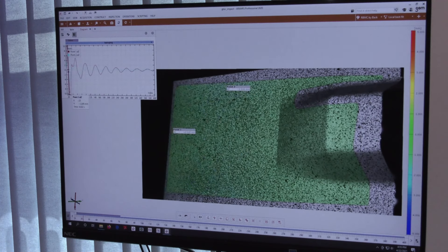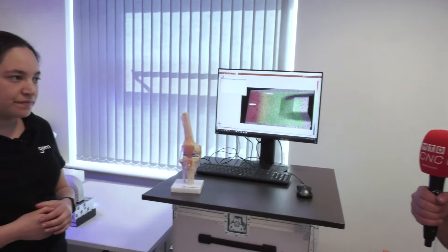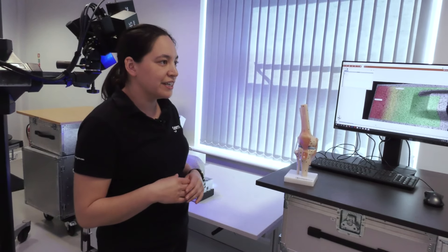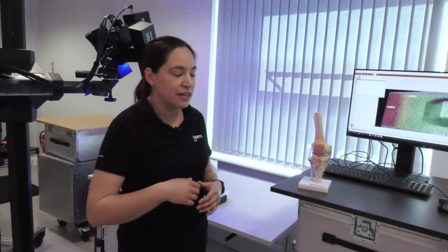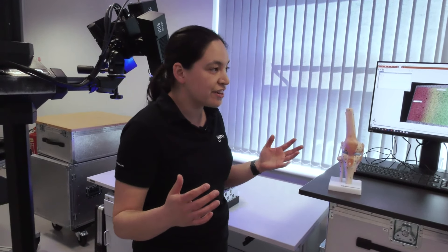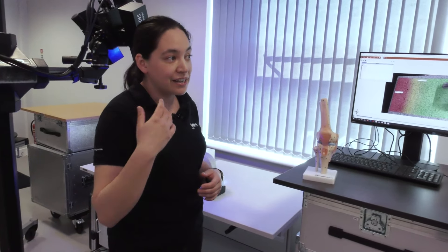Anything that the customer is interested in measuring, we can measure with the Aramis system. A lot of our customers are doing materials testing or component testing, and instead of applying thousands of strain gauges to the part, they can just apply the DIC speckle pattern to measure the strain and really help reduce their testing time.